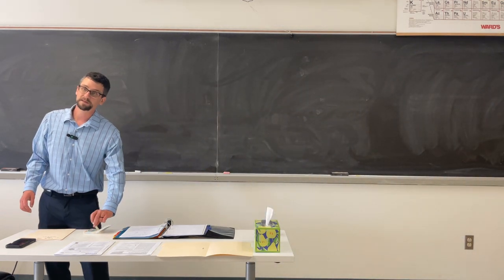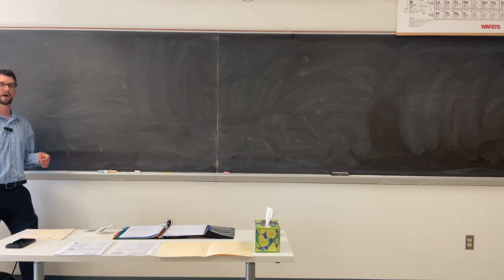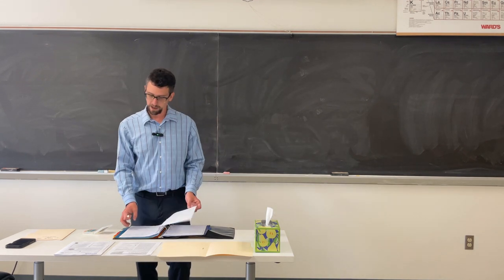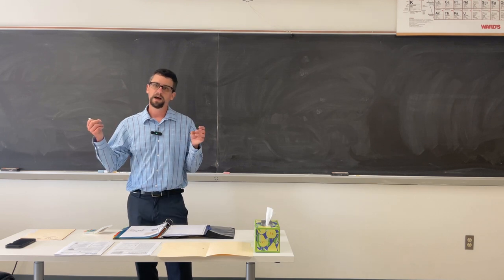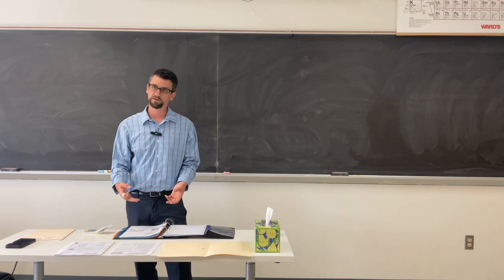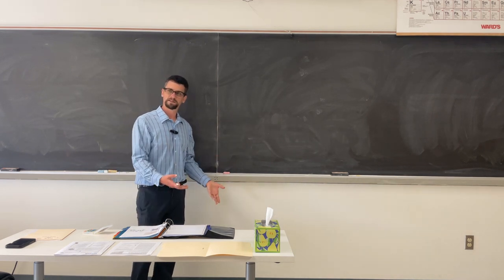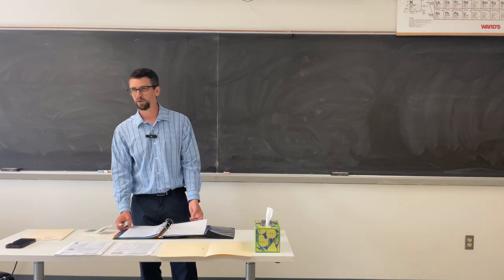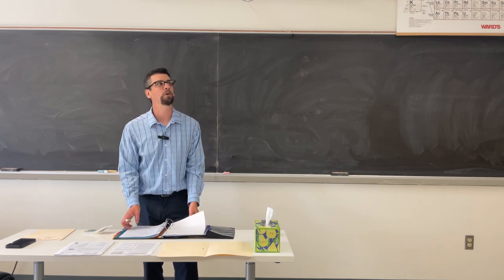We're going to go back to single crystal diffraction. We're going to use some of that powder diffraction stuff to iterate what's going on there. We're going to talk about how single crystal diffraction works, and then we're going to go into the math associated with those diffractions. So just to give you an idea of where we're heading, how does single crystal diffraction work, and then we're going to have to go into some mathematical concepts that you may just need the cobwebs shaken off of.